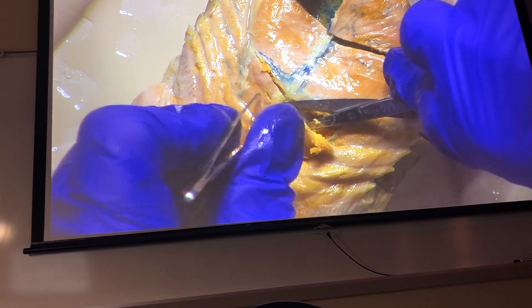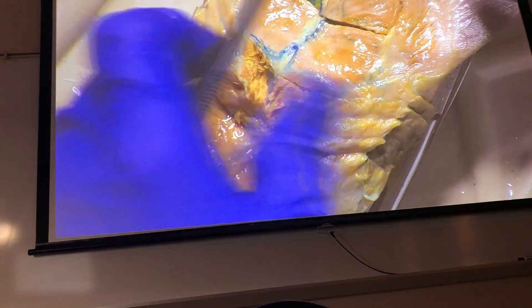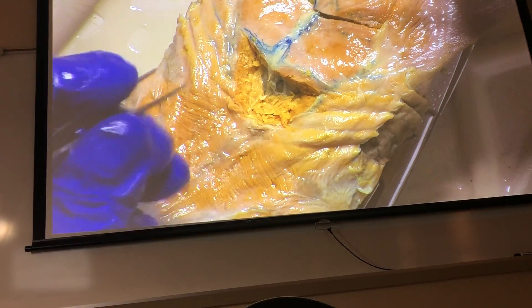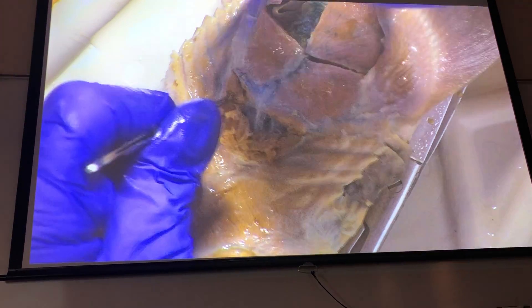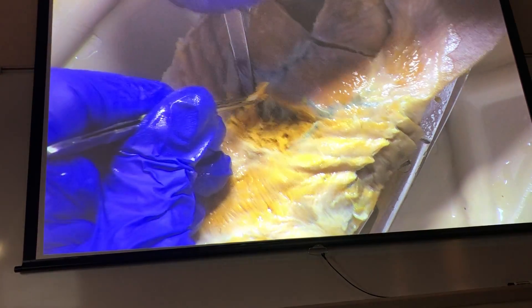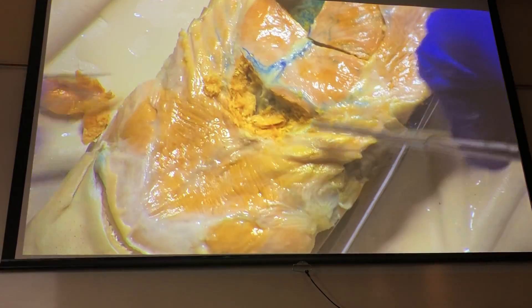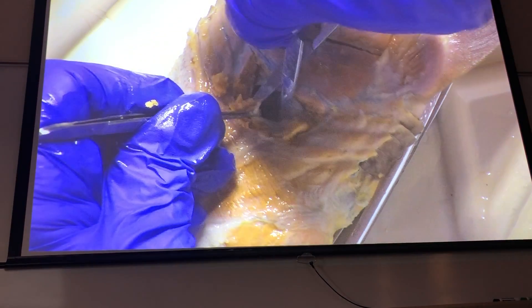It makes it easier for you to see everything. There's the pericardium right up against the common coracoid curals. Cut back a little bit more. Here's our pericardium — cut through that, open things up a bit.